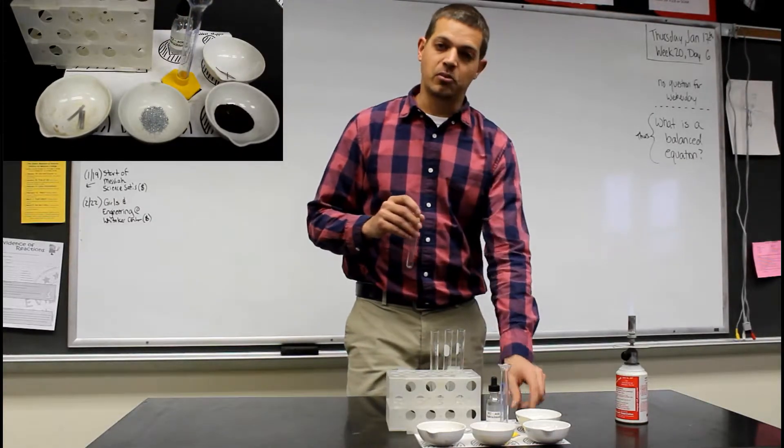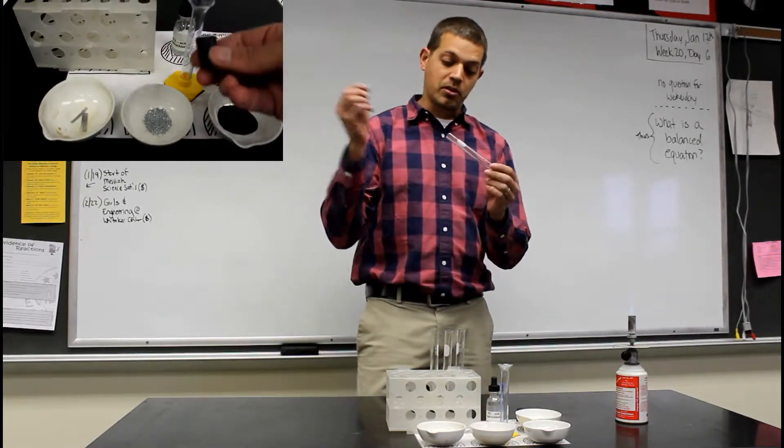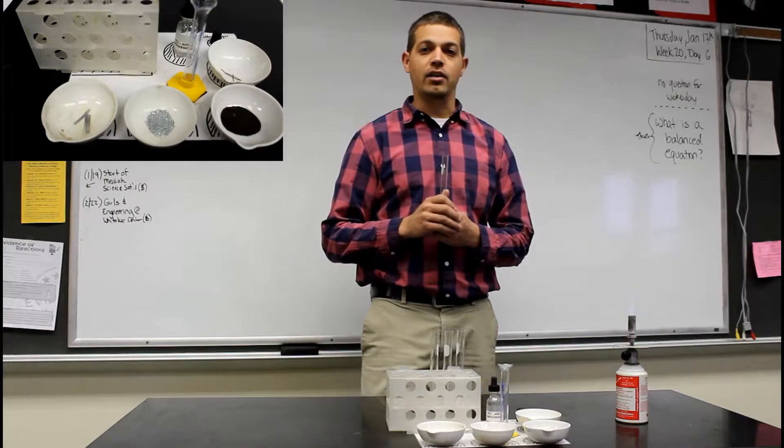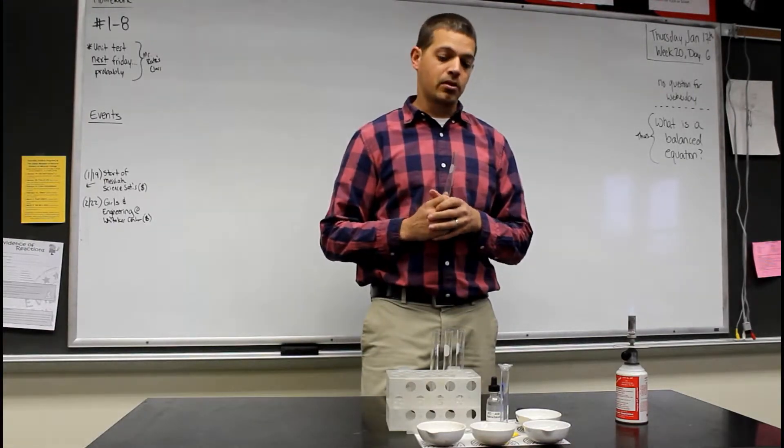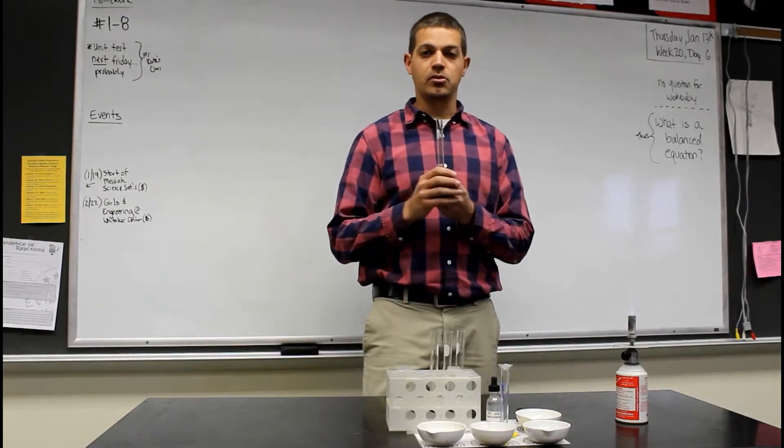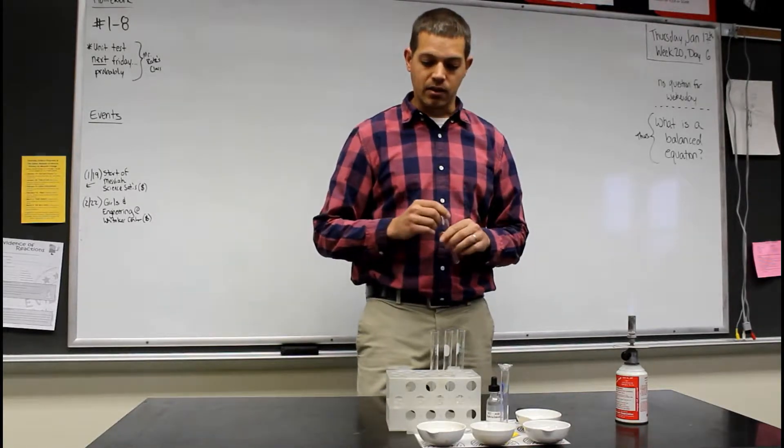If I stick a splint in the test tube, I should be able to see if it's going to react with the hydrogen gas. Hydrogen gas is extra flammable, so we'll see if there's going to be any noise, if there's going to be any fire shooting down the tube. So hang with us in today's lab.